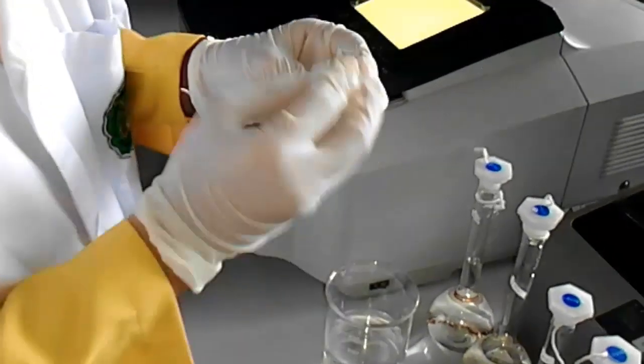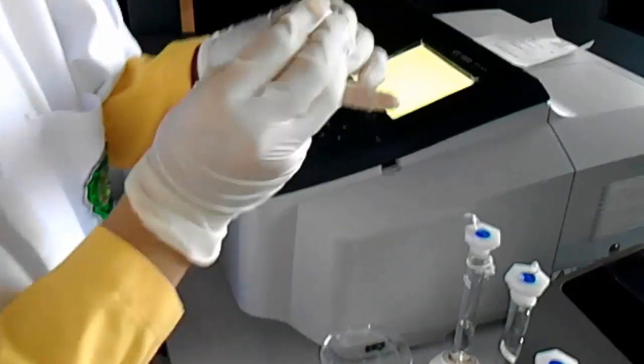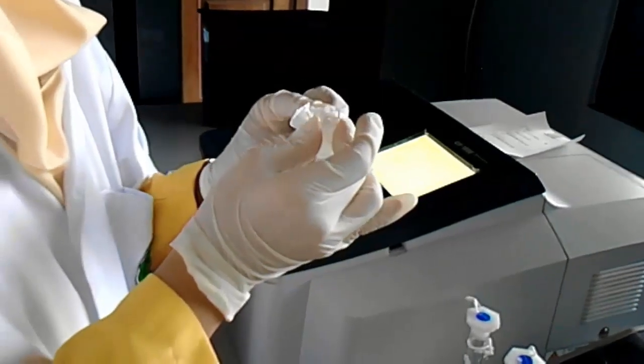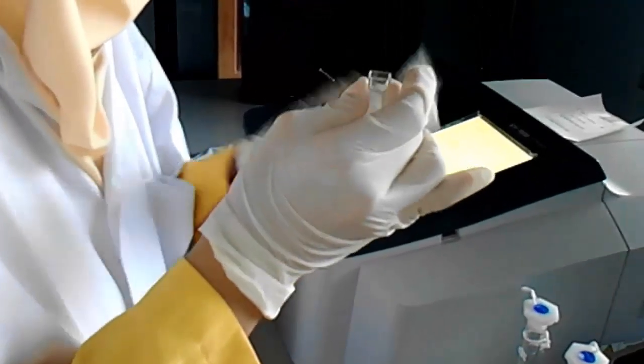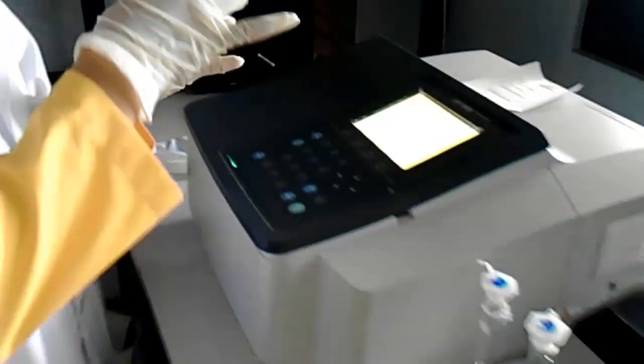Wipe the cuvette with tissue. Put the cuvette in the spectrophotometer.